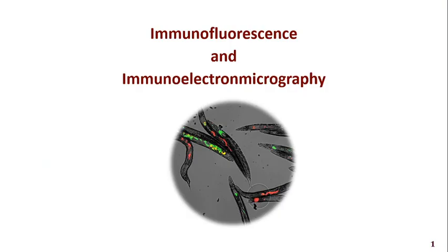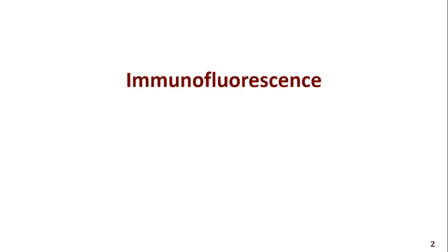I'm going to talk about immunofluorescence and immunoelectron micrography. First, I'll take up immunofluorescence.